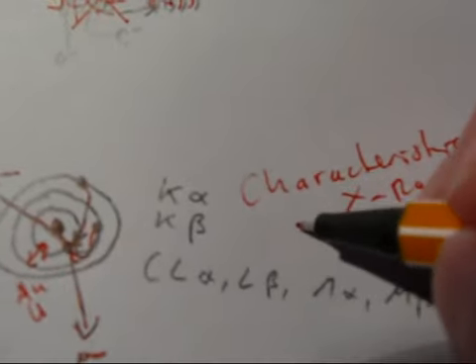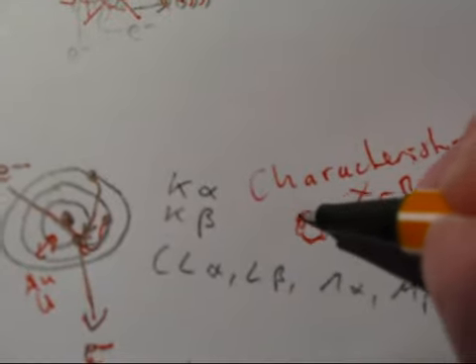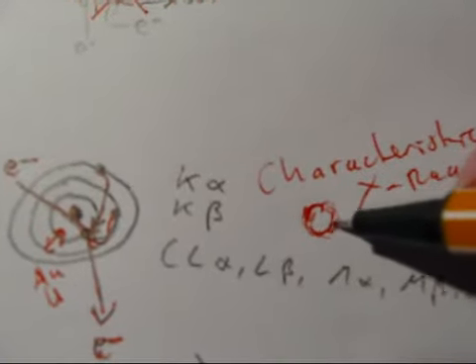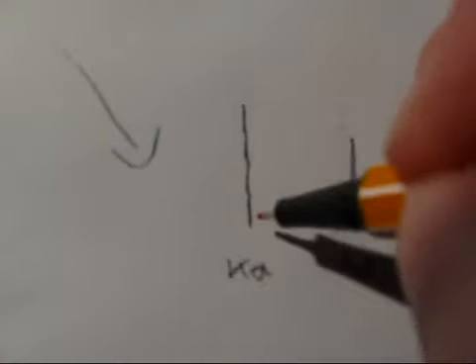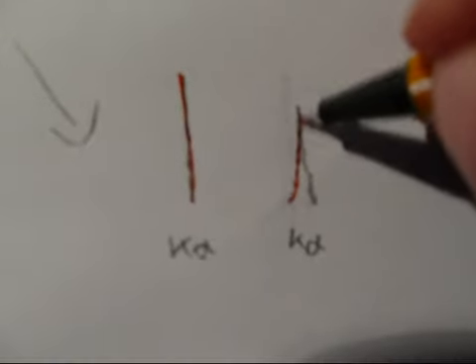But you don't have just one single energy level, you actually have subshells within those energy levels, within the K shell, within the L shell and so on. So the one important thing to note is that you don't get one single monochromatic beam like the K alpha peak like this, but you'll actually get a slightly diffuse beam.